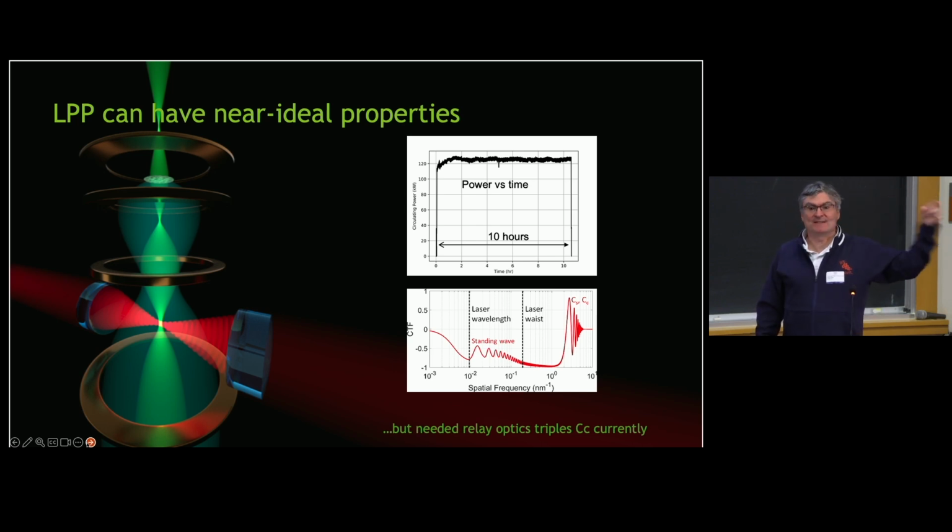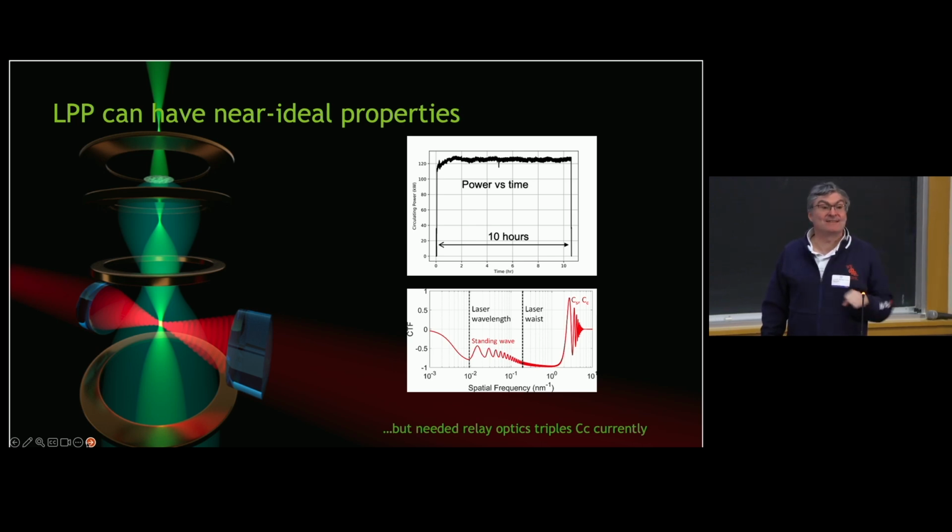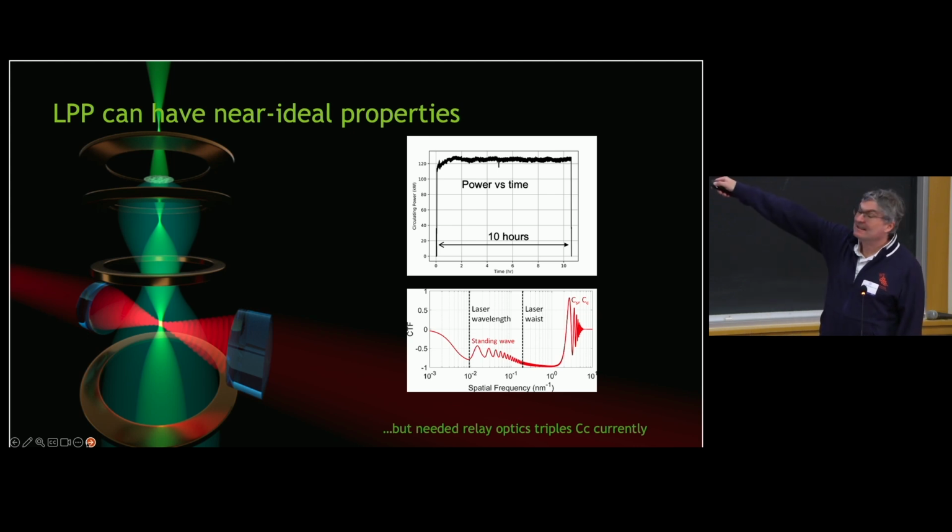so that 10 watts that bounce around 10,000 times build up to form a 100 kilowatt standing wave here. And that is the brightest continuous wave laser spot ever made. So this is no joking matter. And it phase shifts the electron beam here. Early on, we found we can sustain this power until we turn it off. We've never seen any degradation of this system.